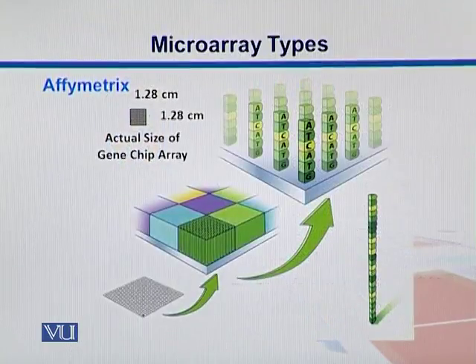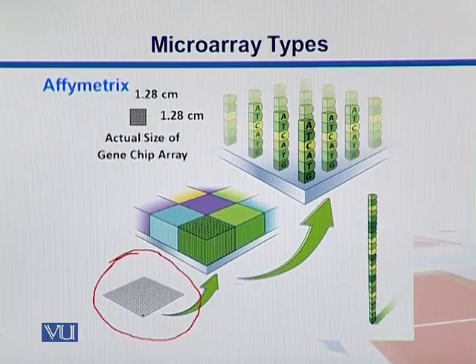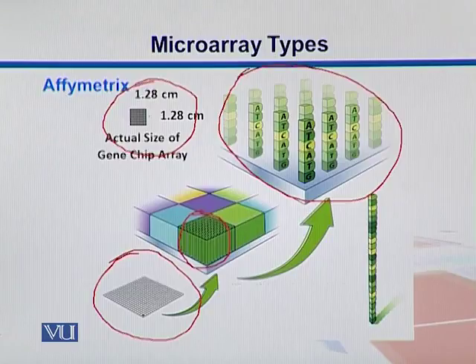So here is Affymetrix in detail. We have these stations, thousands of small square sections. In each station we have millions of small DNA molecules attached, which are the probes. Here you can see the relative area, so you can have a scale in your mind if you want to compare these pictures. In each region we have those probes, and we have different probes for a single RNA species. So we have 11 probes per species.